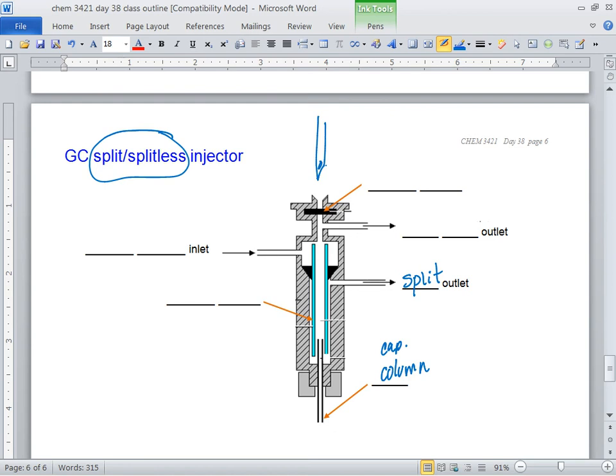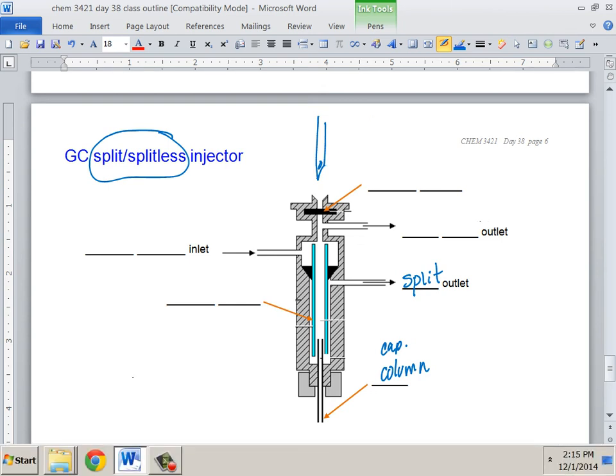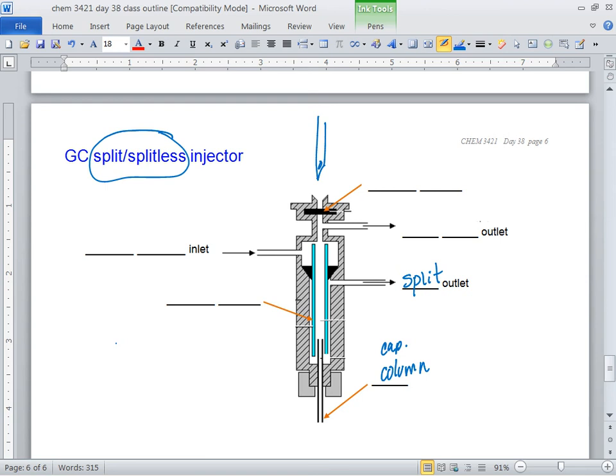But it has to puncture. You would think, and I still don't, maybe they have found something, but it's super expensive, but I don't think so. Rubber is all we have to seal this system, and it causes a lot of problems. It causes a lot of problems because if you go to Sam's, down the tire aisle, what do you smell? Rubber. You smell the tires. Depending on who you are, that may or may not be good. But it's a real problem. I can't relate to you how extremely sensitive these instruments are. If you take a little piece of that rubber tire and heat it a gazillion times trying to drive off all this gas, and you can't even smell it anymore, you heat it a gazillion times more, it's still permeating gases. That's just something rubber does.